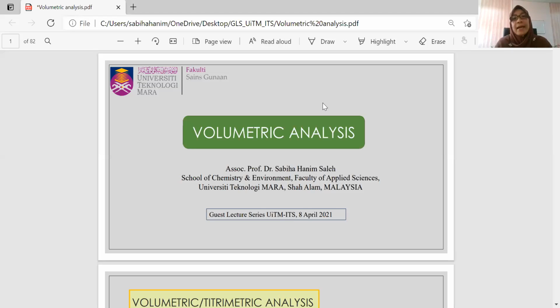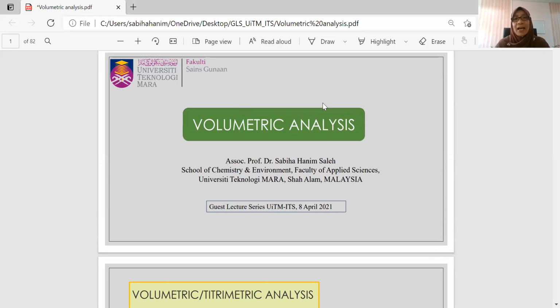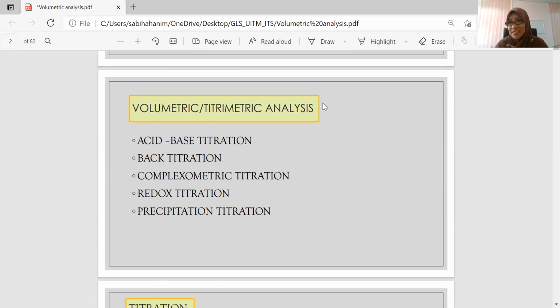Okay. So the title for today's lecture, I chose volumetric analysis. First, I would like to ask the students, does anyone know about volumetric analysis? Any students? I can interact with the students, right? Yes, you can interact with them. Anyone to tell me what volumetrics is? Okay, it's okay, we will go through it. Volumetry is actually what we also call volumetric analysis.